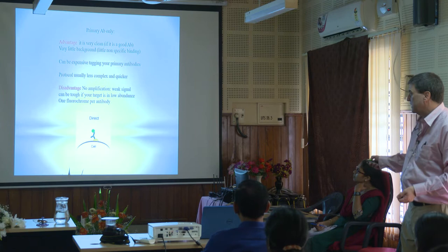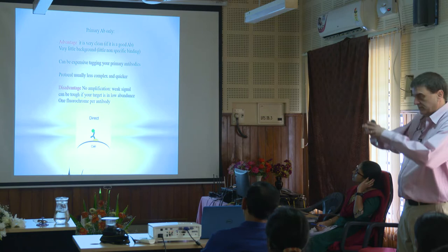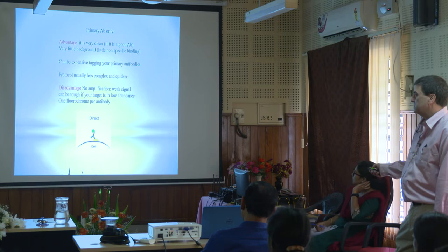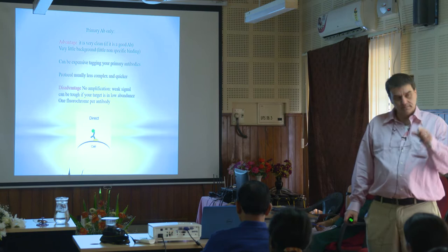A lot of times the protocol is a little quicker because you don't have a secondary step. The disadvantage is you don't get this amplification, the multiplication of the signal. It can be tough if your target is in low abundance especially. If you're looking for something in low abundance, quite often you'd want to use the secondary system just to make everything brighter.